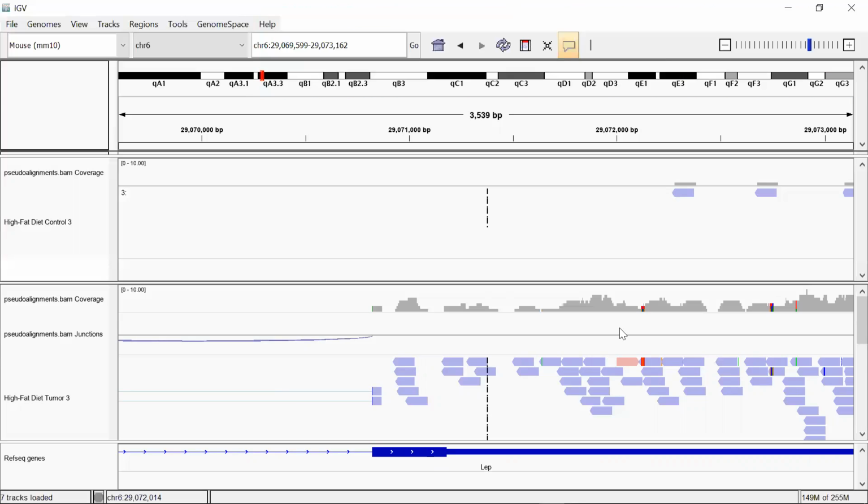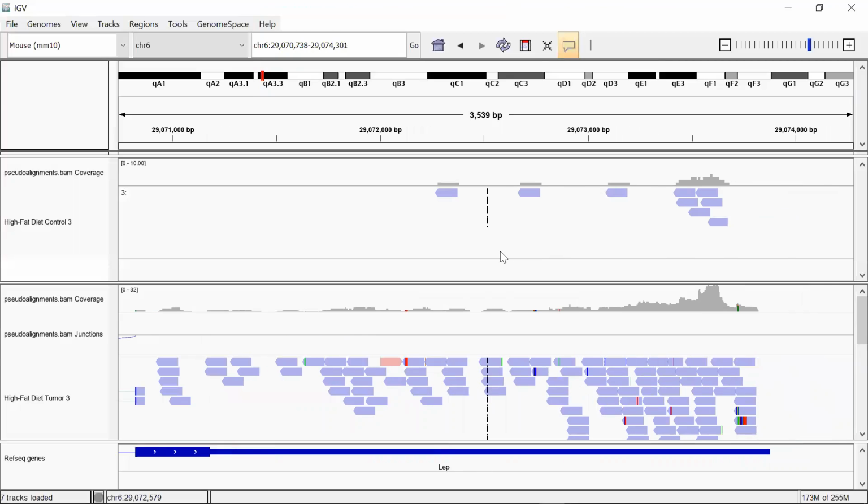This is what we did overall for GEA: we got onto their website and ran a quality trimmer called Trimmomatic. We looked at qualities using a program called FastQC. Then we did alignment of reads against the genome, and these are just sample alignments that have been pre-computed, but one of these is the one you guys did.